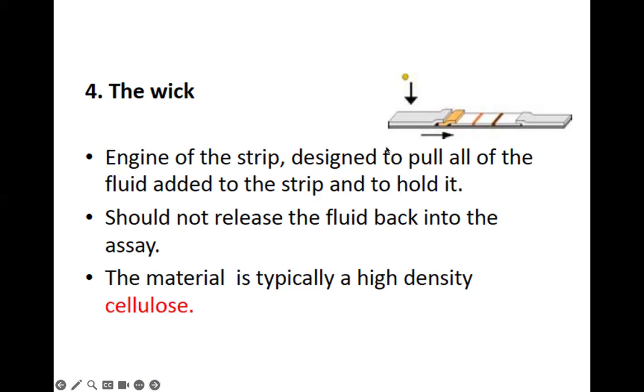And the viscosity of the samples, especially for those who are working with a sample that is very viscous, sometimes the problem is that it cannot move towards the end. It probably stops here or stops in the middle. So that's something that also has to be countered. How do you balance the dilution and make sure that the sample is thin enough for it to move along the lateral flow? So this is based on our experience.